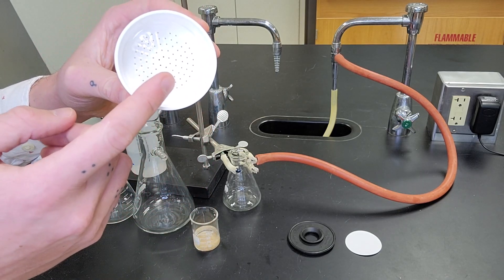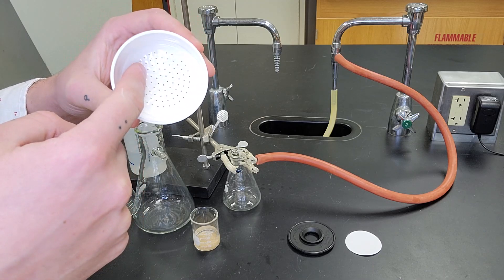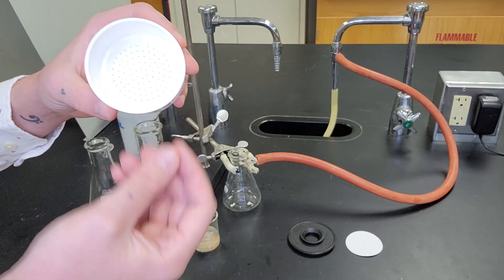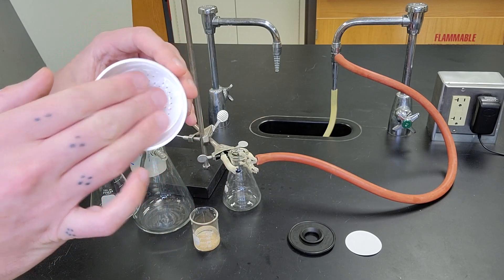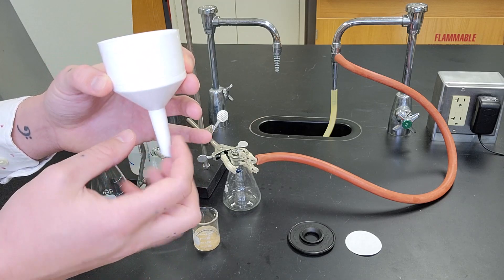But the difference is it's got little holes at the bottom of the top filter part, and this is actually where the vacuum is going to be pulled. By putting a filter paper on top of these little holes, we can leave the solid behind and pull through all of the liquid.